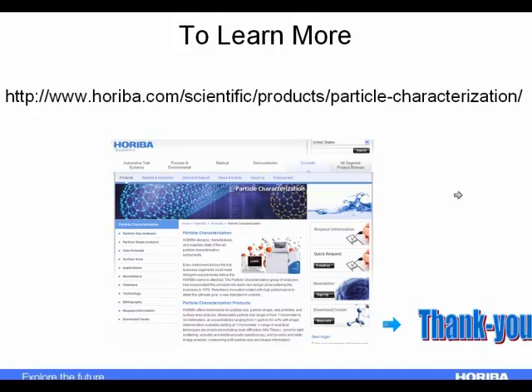Yeah, probably. When we use dynamic light scattering, that was the Stokes-Einstein equation. By looking at the Brownian motion, we find a route to determine the D value, the translational diffusion coefficient. We then use Stokes-Einstein to calculate RH.